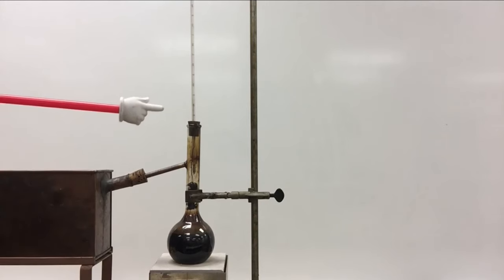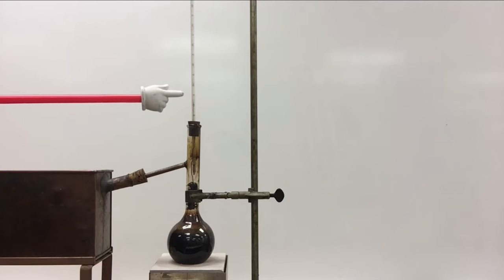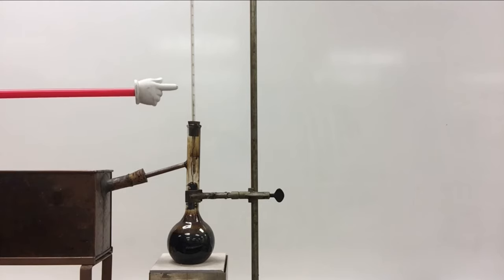The thermometer is reading a little bit over 100 degrees right there. So maybe 105 degrees, maybe 110 degrees. And I have nothing coming out of the cylinder yet. So I know that I don't have any pentane coming out. But we'll watch carefully, because it's maybe going up to 125, and I'm going to turn down the heat just a little bit. We're going to watch and see when our first drop is.